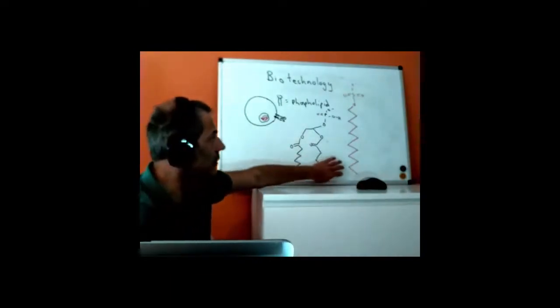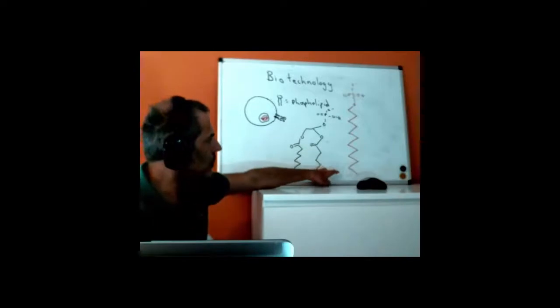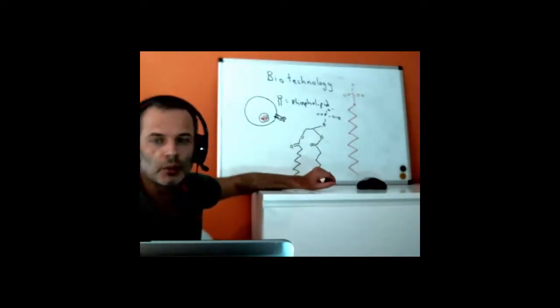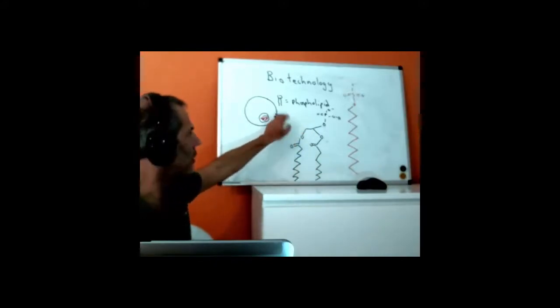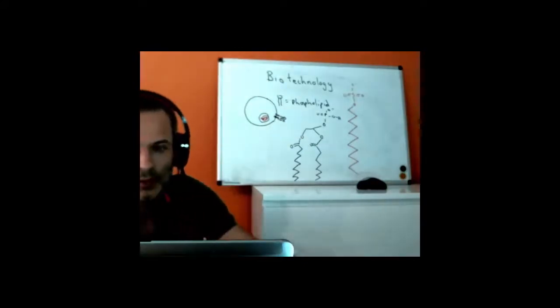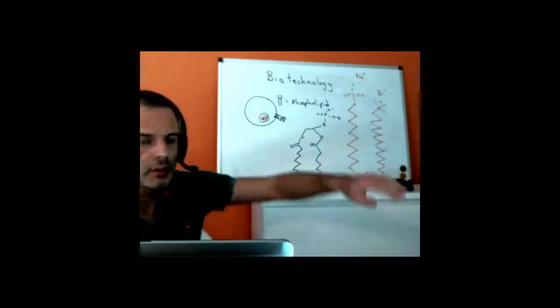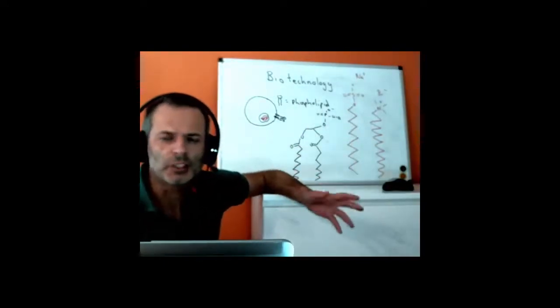What we're going to do is mix this with our cells, and the soap will get in between these groups, behaving like one of them, but instead of forming a double layer, it will tend to make a hole in it and let the insides become outsides, which is obviously not great for the cell. This other soap that I've drawn just over here is actually better, but it's quite expensive.